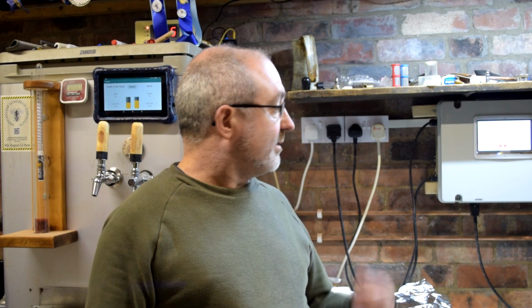Hello and welcome to the brewery. And well, it's the end of a brew day at the moment. I'll be making a Marzen, but that's not particularly important to this video. What we're going to have a look at in this video, and this is my first attempt at this, is counting yeast cells.